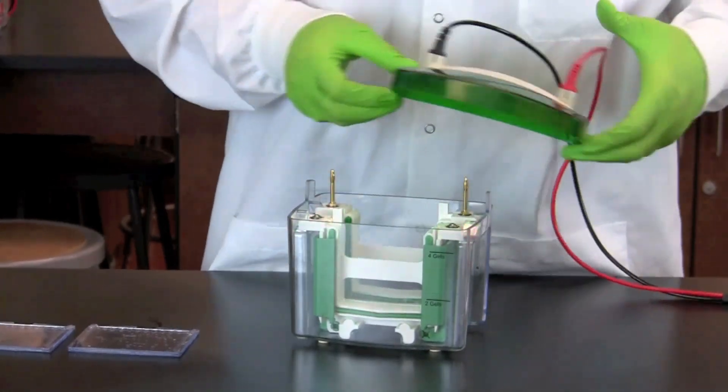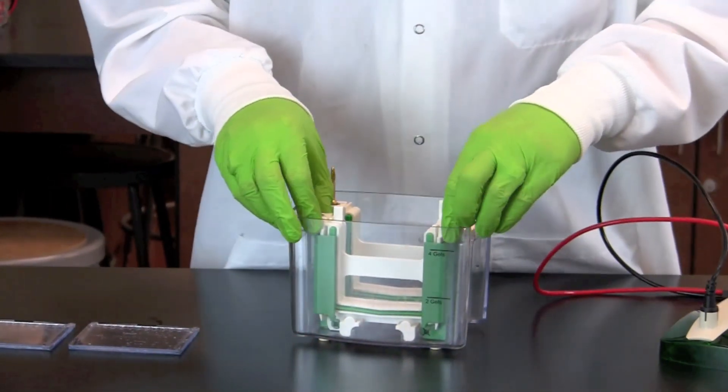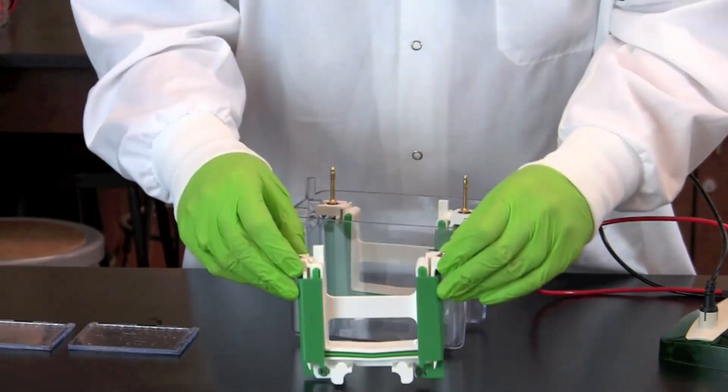To set up the vertical electrophoresis system, remove the electrode assembly from the tank, and open the green clamps.